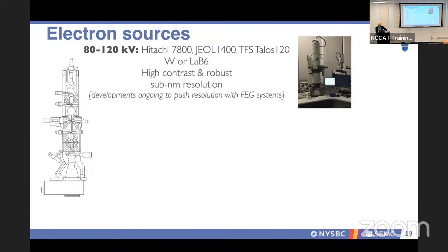And that sort of goes with an electron microscope. If you've ever bought a light microscope, they're very modular. So if you say, let's say you got Nikon or Olympus, et cetera, you want these objectives, you want this stage, do you want monochromators, do you want other different types of electrons or light sources?